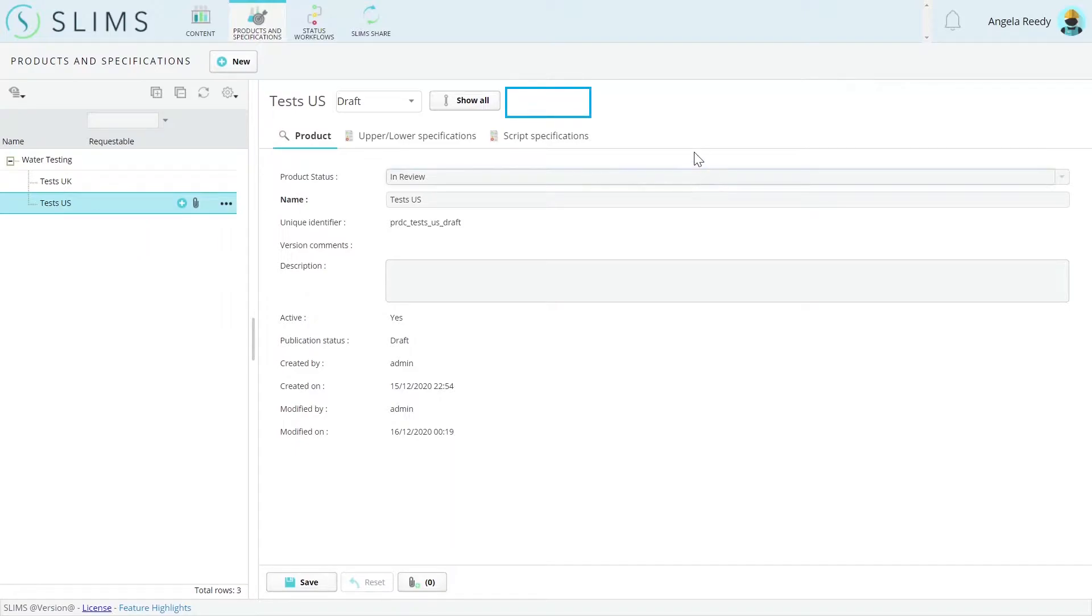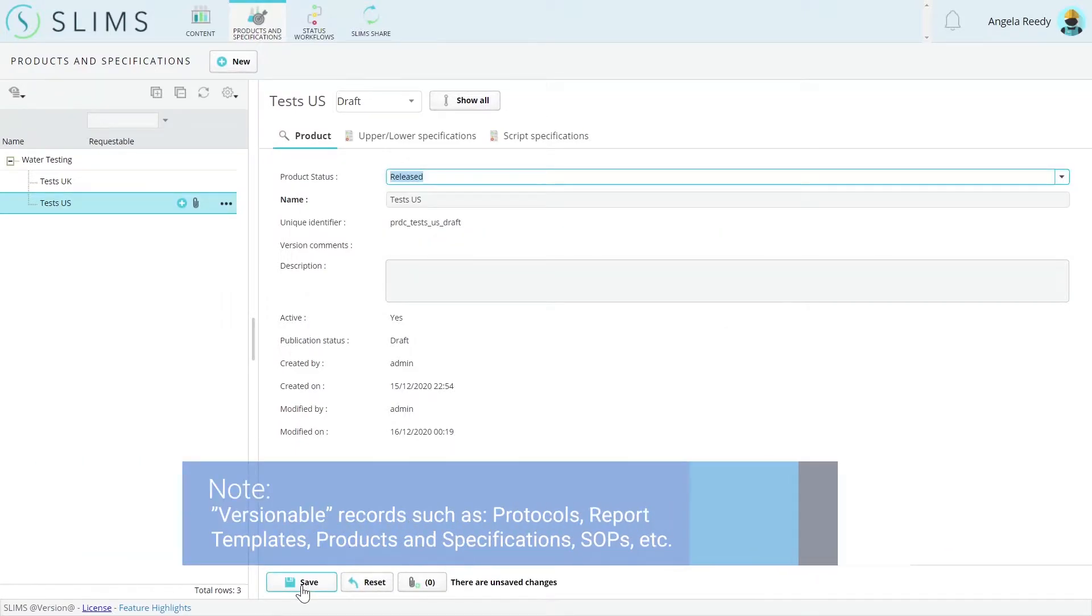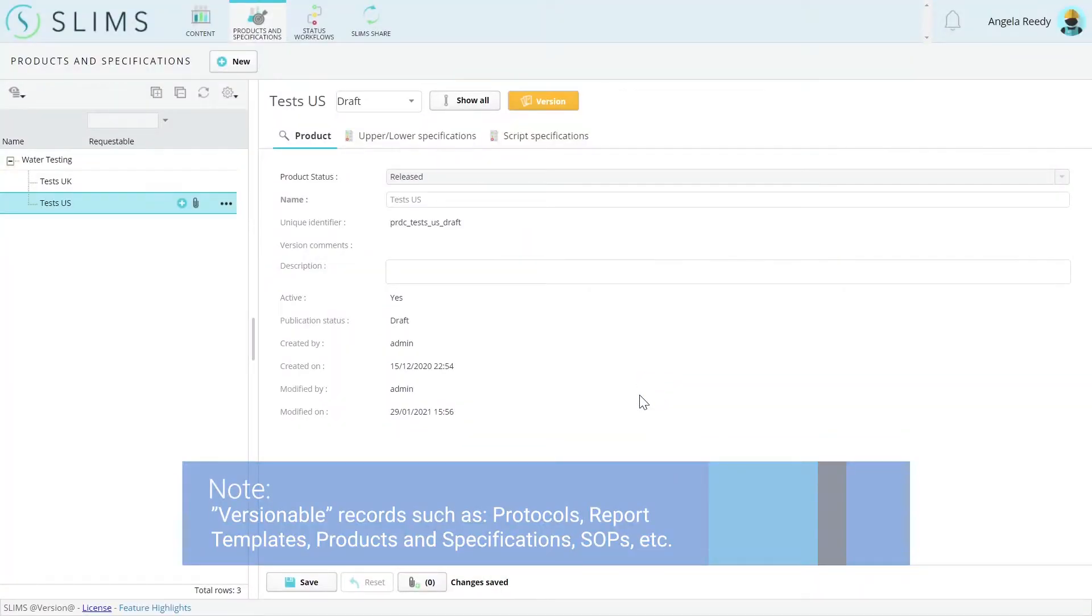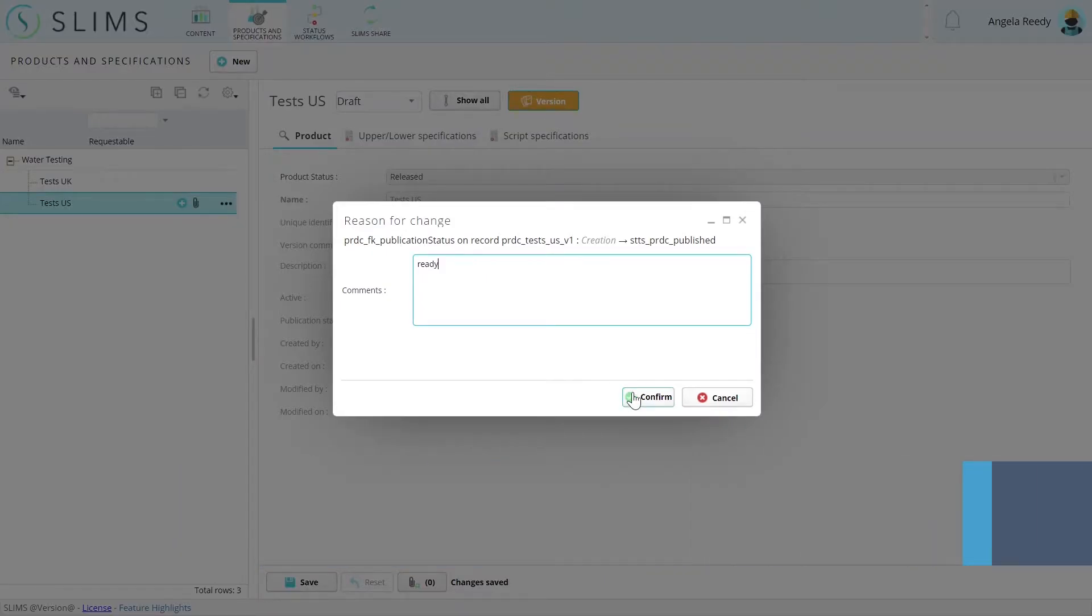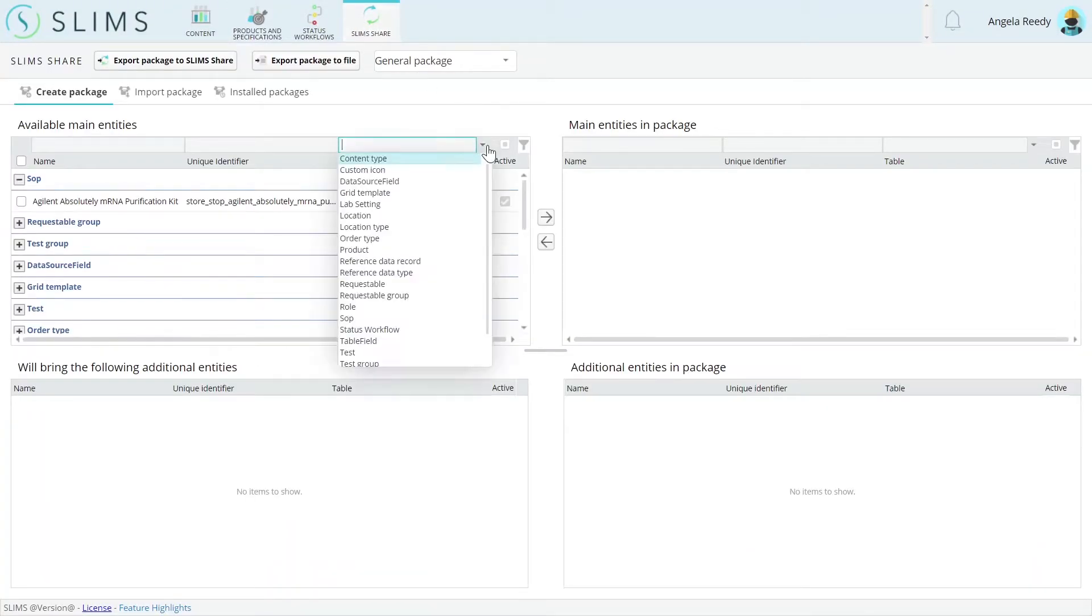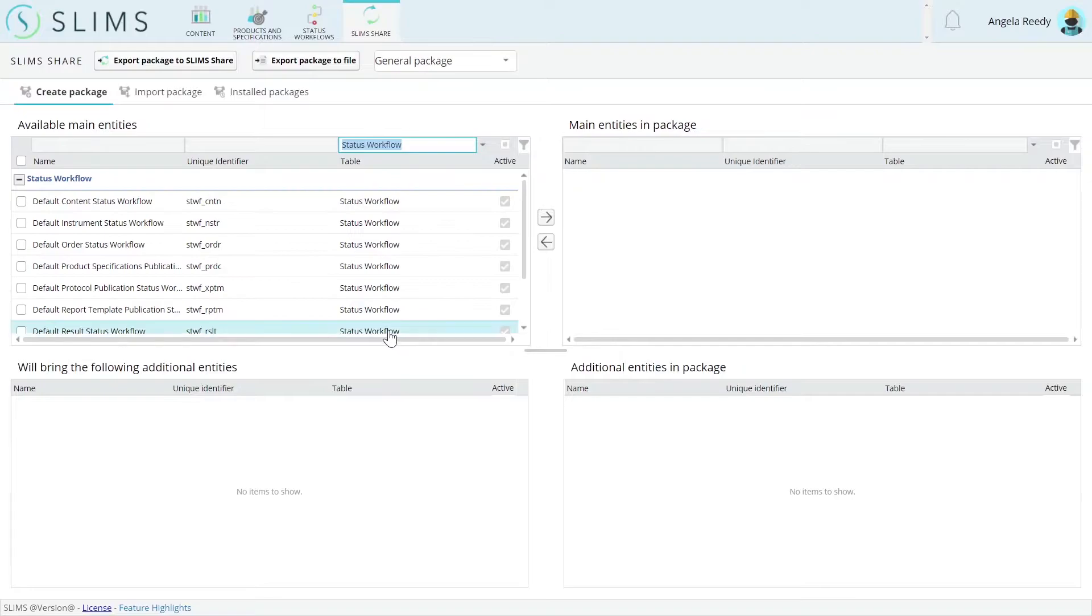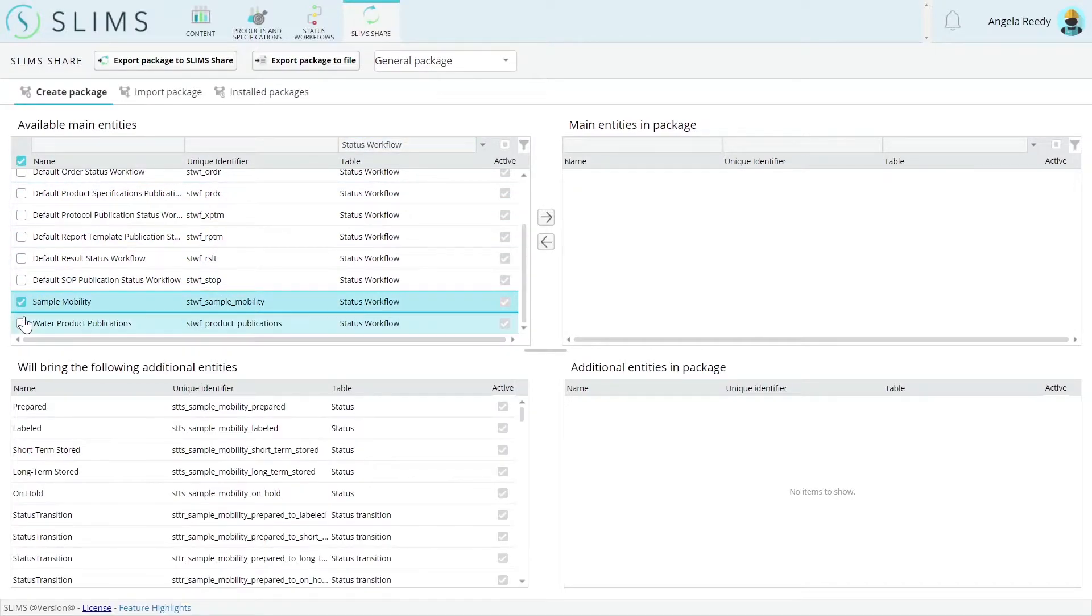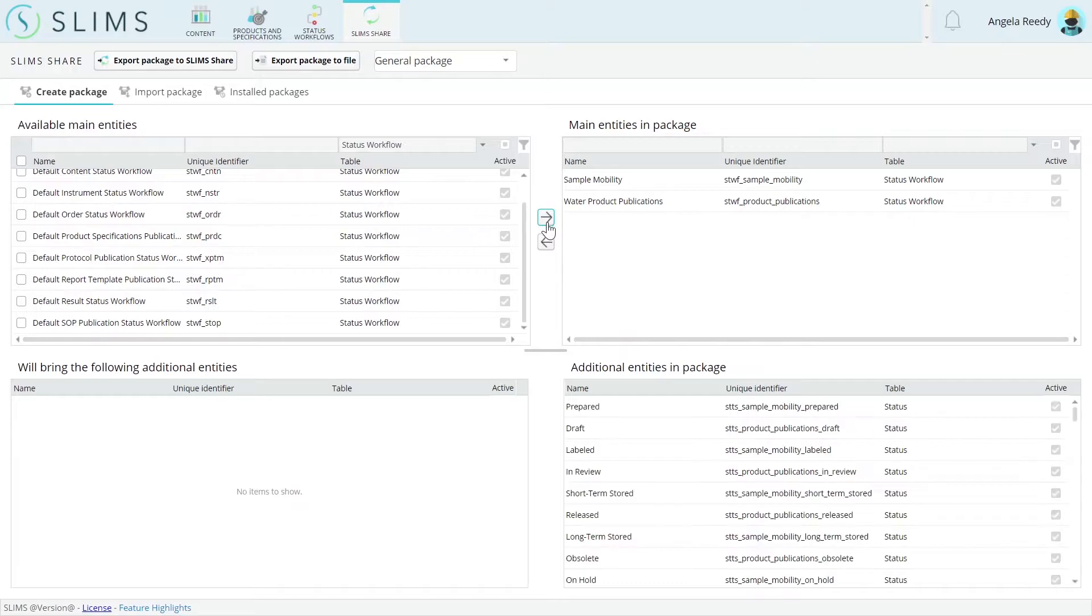Custom publication status workflows can be created to support any needs you have for versionable records outside of the default versioning systems. Status workflows can be exported and imported using SlimShare to easily use your custom status workflows across all your instances.